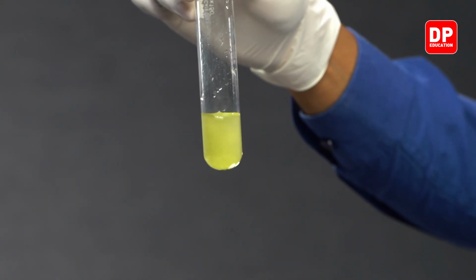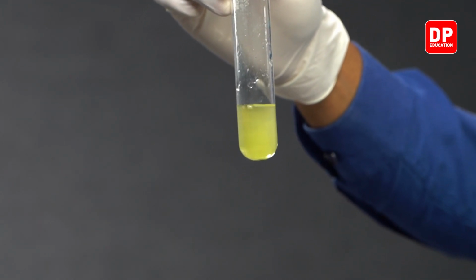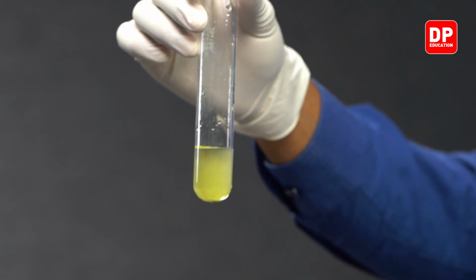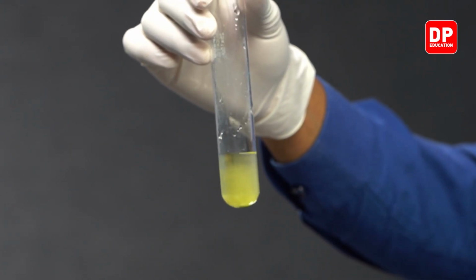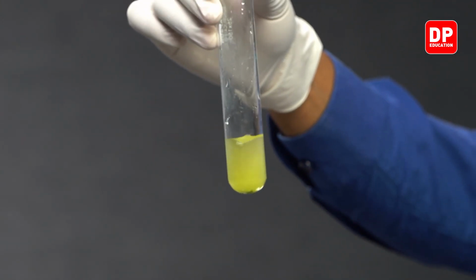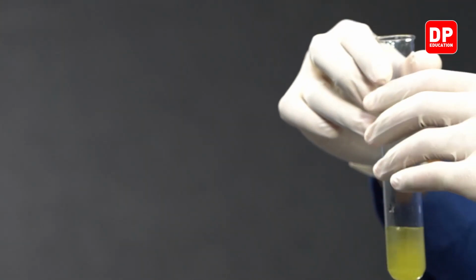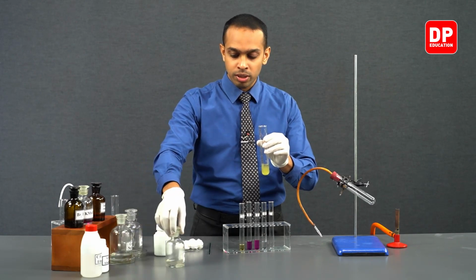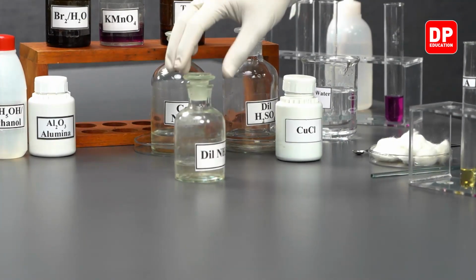but when we add ammonia, we are going to see most of this cuprous chloride will dissolve to form a complex with ammonia, and the solution will change its color from this green color to a blue color. So let's take a small amount of dilute ammonia. We have our dilute ammonia bottle here.